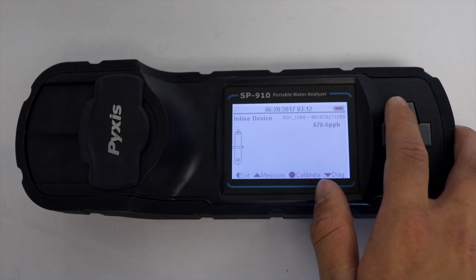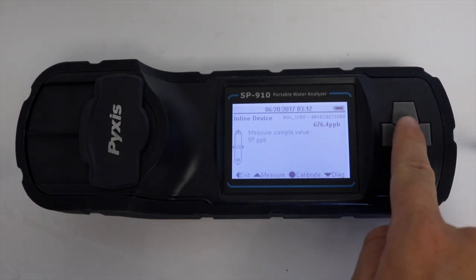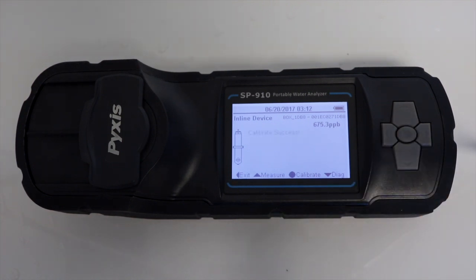Then select measure. The SP910 will measure the sample value. Select calibrate. A calibration success message will be shown.